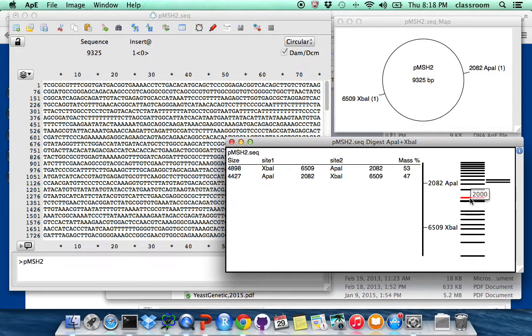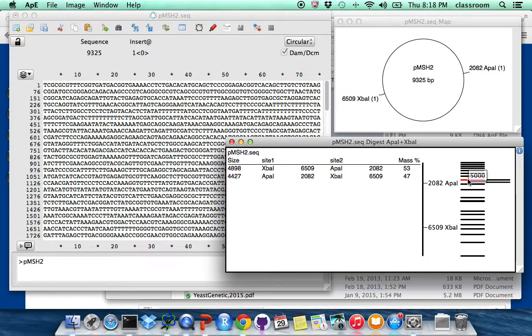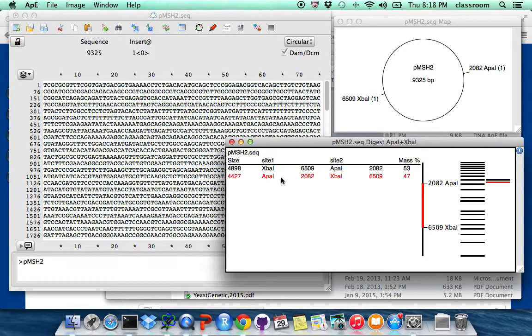1650, 2000, 3000, 4000, 5000. So between 4000 and 5000, that's the two fragments.